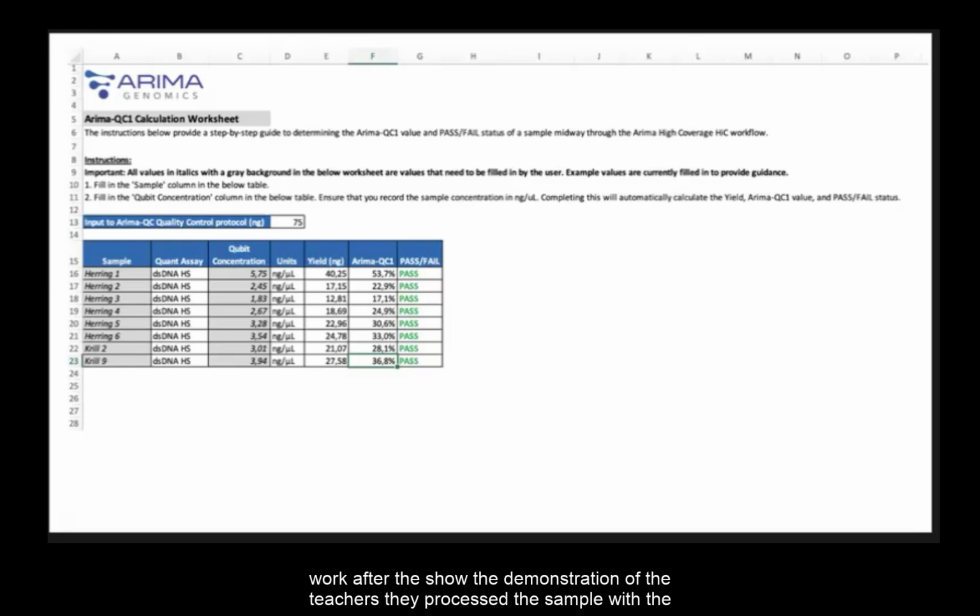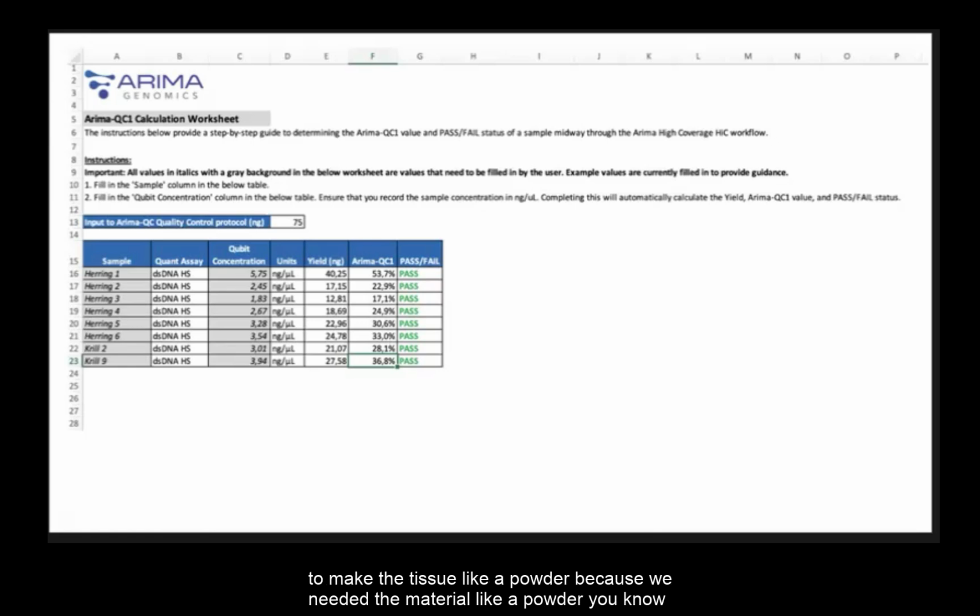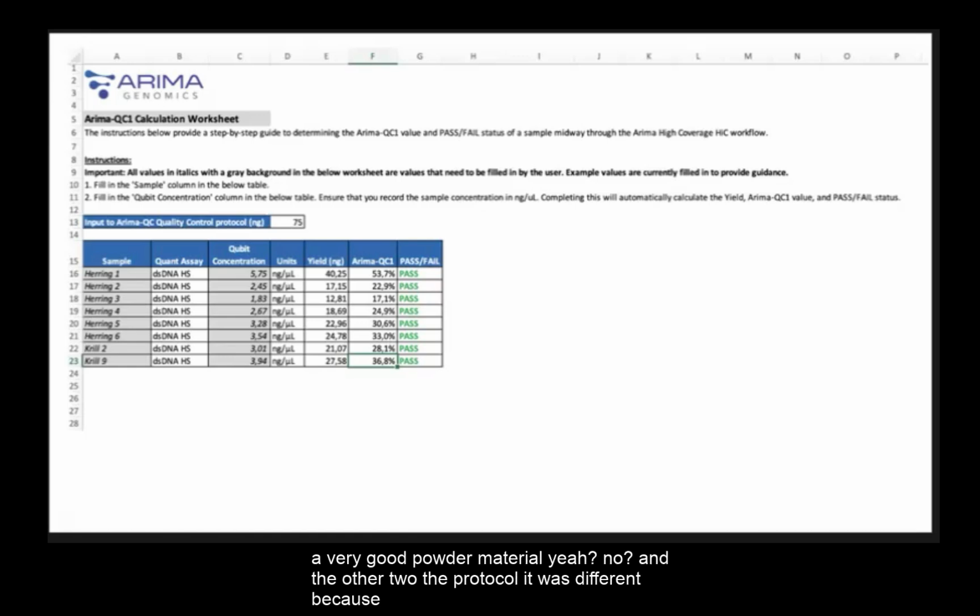The assistants worked after the demonstration of the teachers. They processed the samples, weighing all of them to have around 100 milligrams. Sometimes it was a little more, sometimes a little less than 100, but it was around that. After that, they used liquid nitrogen to make the tissue into a powder, because we needed the material as a powder to process on the first day. They did all of this to the first 6 samples, and using the liquid nitrogen they had a very good powder material.